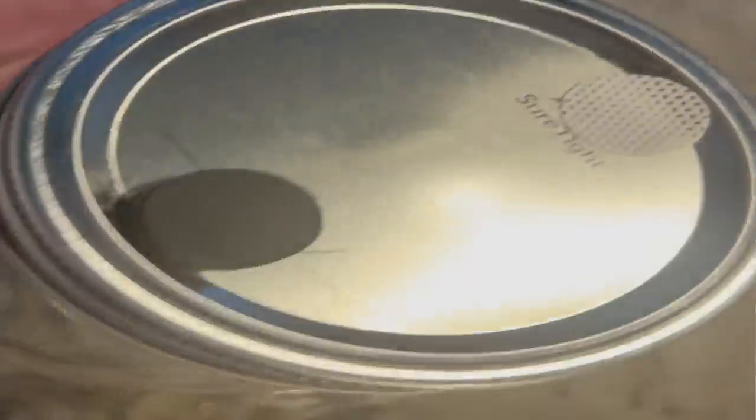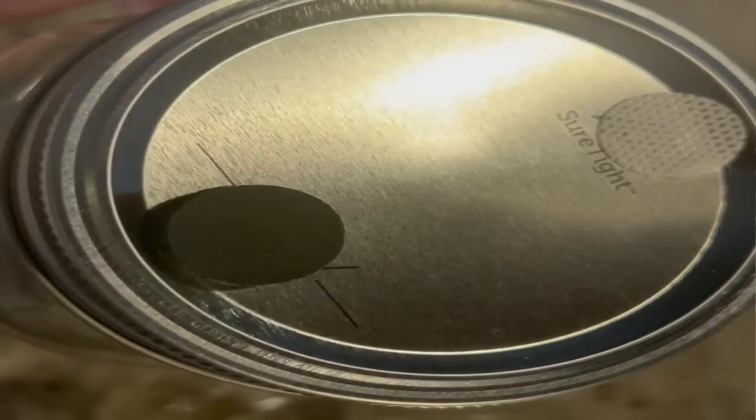The first thing you need to do is make some jar lids. I have videos showing how to do this. You want to make sure you have a self-healing injection port and a gas exchange hole with some type of filter over it. For my self-healing injection port and gas exchange filter I'm going to be using Micropore self-healing injection ports and filters — I think they're the best. If you want to use RTV and Micropore tape, that's perfectly fine too.